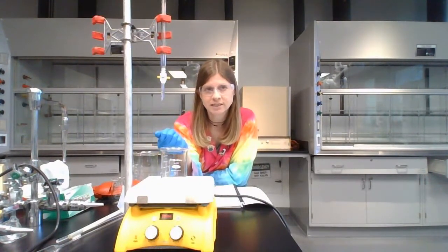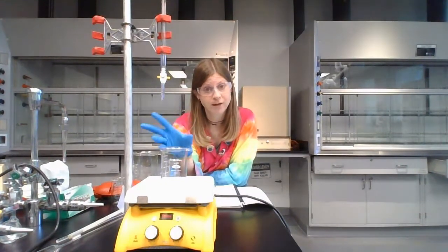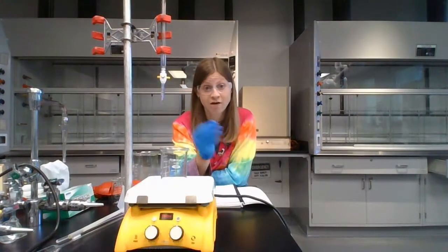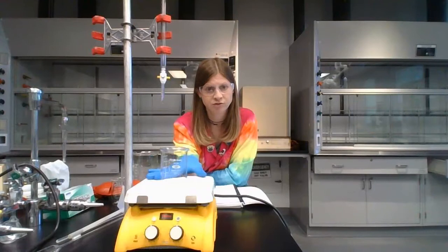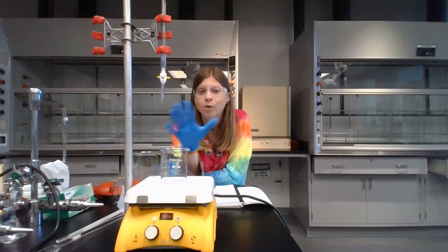Okay, the stir function on our hot plates almost doesn't get used enough, so it's really, really excited about its job. It stirs, like even the lowest speed of the stir function is still super duper fast. So sometimes we see little splatters come out. Little splatters are okay, but if we see lots of splatters, then we'll turn off the stir function and alternate, turn it on, turn it off, so it doesn't get bad. Because what we don't want is to have very much sulfuric acid end up on the surface of the hot plate. My hot plate is not on right now, which is why I'm able to touch it. You're not going to be touching yours when it's warm. But we don't want any chemicals to spill on the surface of the hot plate while it's warm.